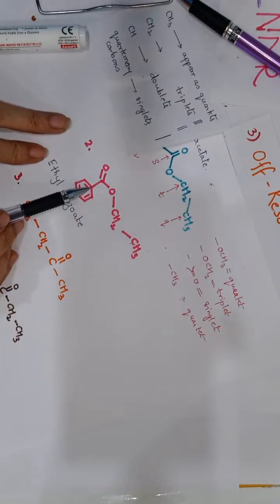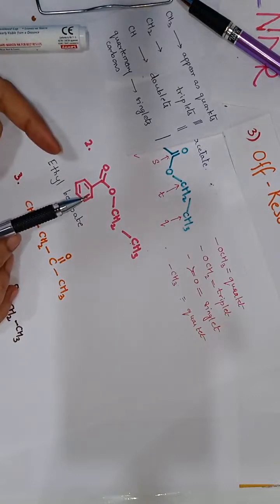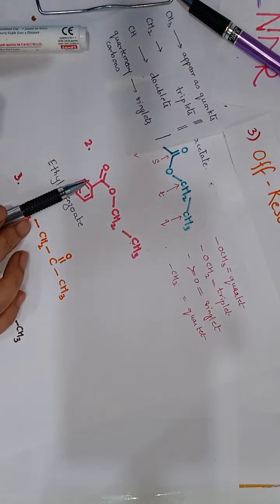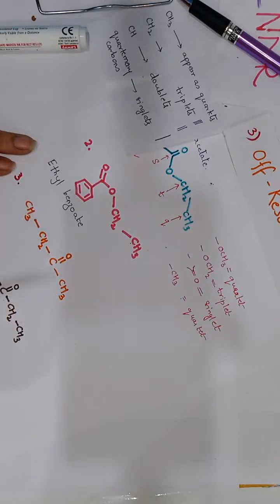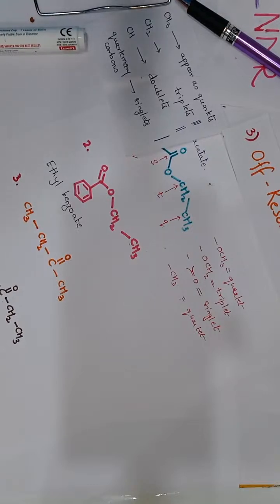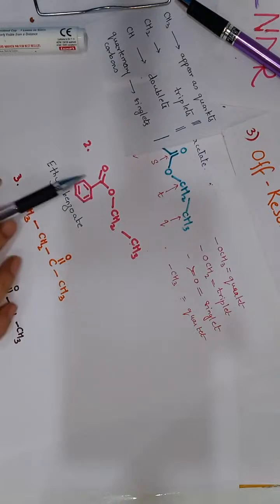This is a carbon, carbon, carbon, carbon, carbon. When we observe this kind of structure in our BBD spectra or in our other spectra, the undecoupled spectra, in BBD if all the carbons are the same, they will be equivalent.